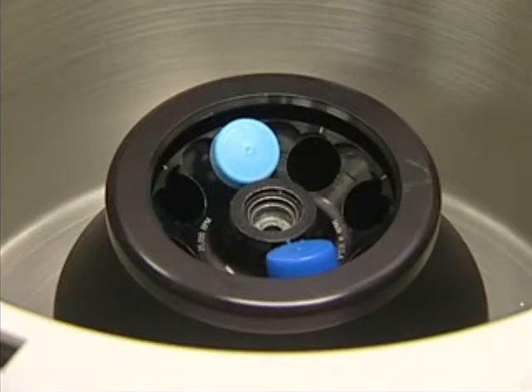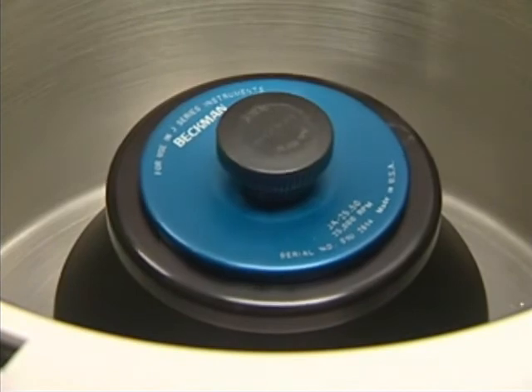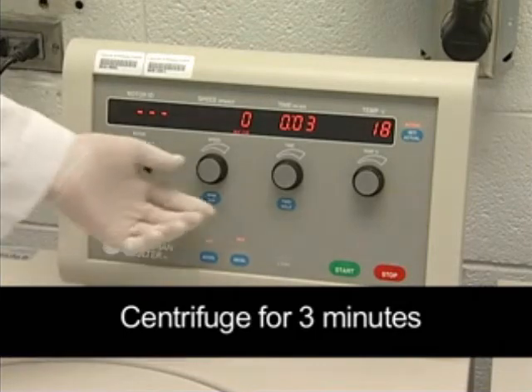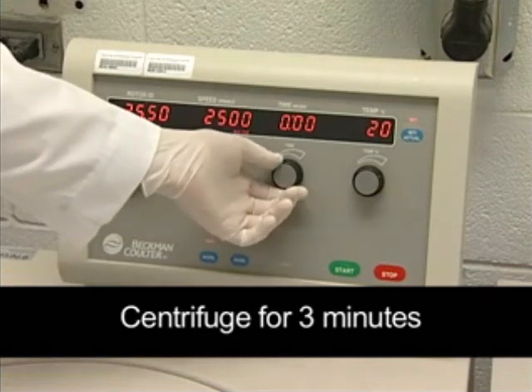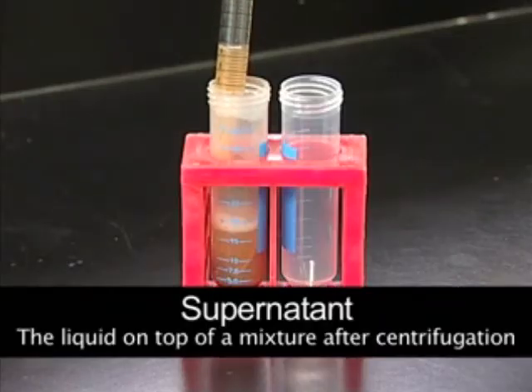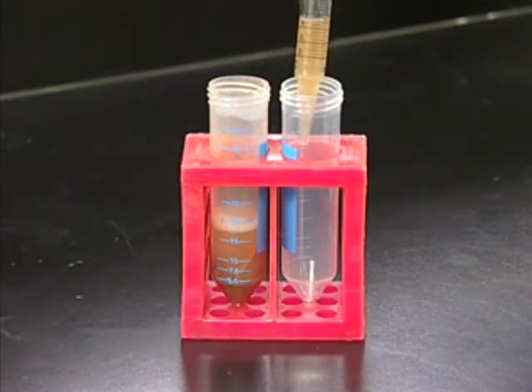After the vortexing has completed, you will want to take the tube and centrifuge it. The centrifuge should be set at 2,500 g for 3 minutes. After centrifugation, carefully remove the supernatant by pipetting the liquid up, being careful to avoid disturbing the pellet at the bottom of the tube. This supernatant is then transferred to a new clean collection tube, which can be found in the kit.